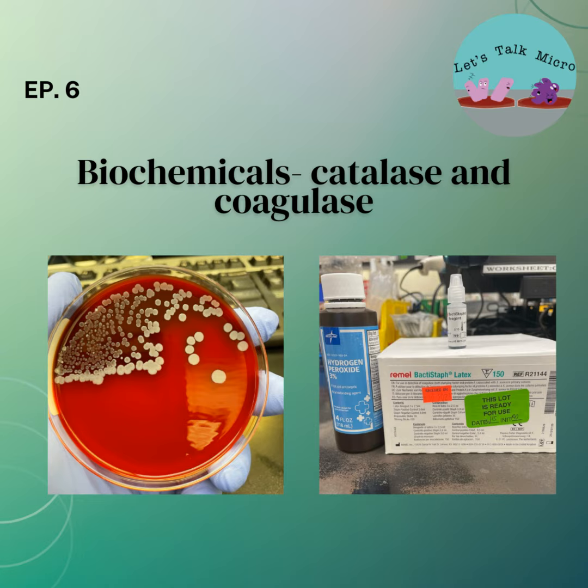So going back to the biochemicals, how are they helpful? They help us identify organisms. Organisms can have reactions to biochemicals that can be distinctive of them. For example, oxidase and the Enterobacterales. Do you remember what's the oxidase result for an Enterobacterales or Enterobacteriaceae? They're all oxidase negative.